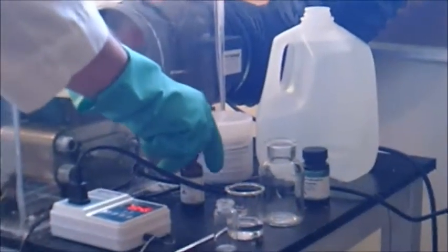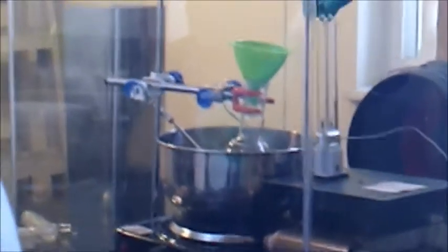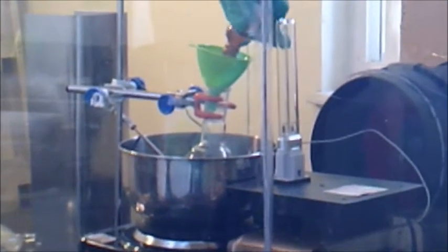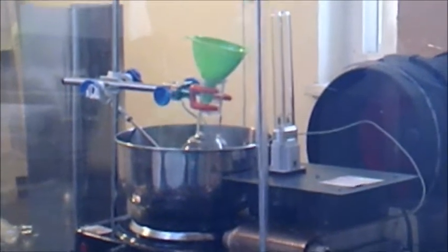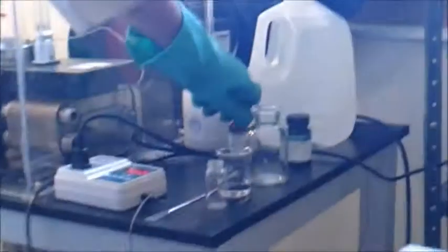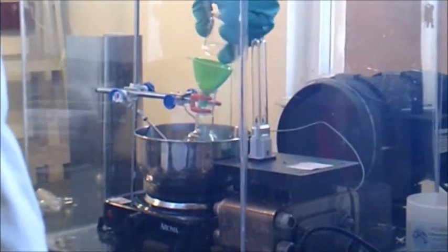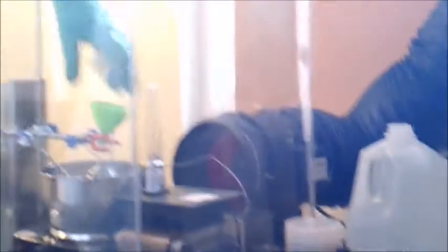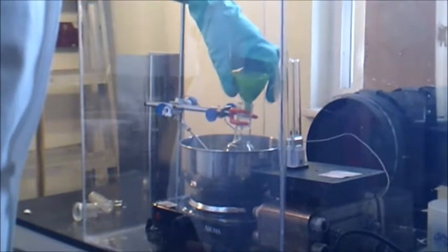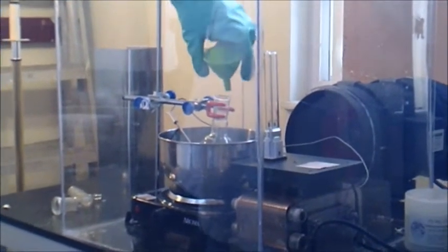Okay and next we are going to add our formamide. And again 30 milliliters of formamide will be added. And lastly we add our 20 milliliters of distilled water. So we have our 20 milliliters over and then I'll add to our flask.